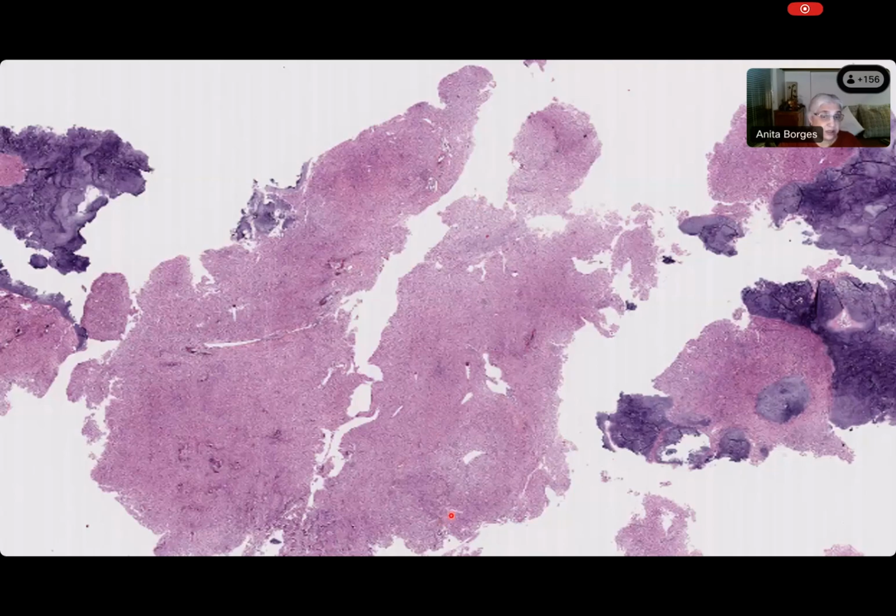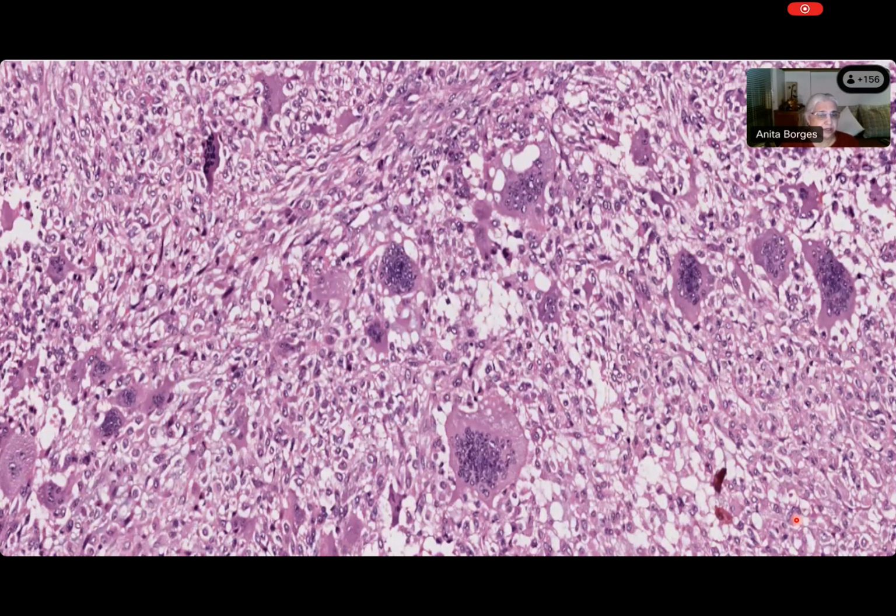A very cellular tumor. Okay, in which you cannot make out at this far whether there is a matrix or not. That you can see cartilage is without a doubt, and some of this cartilage is actually sitting within this very cellular tumor. You agree, Prayas? Yes. Okay. Right. Now let's go to the cellular areas. And what do the cellular areas show you?